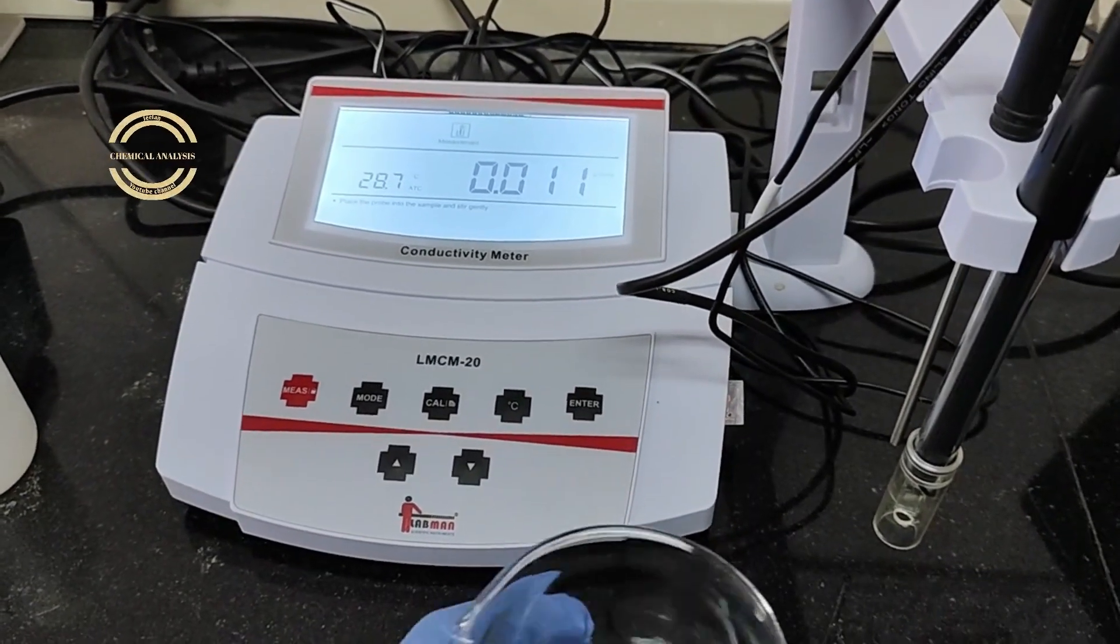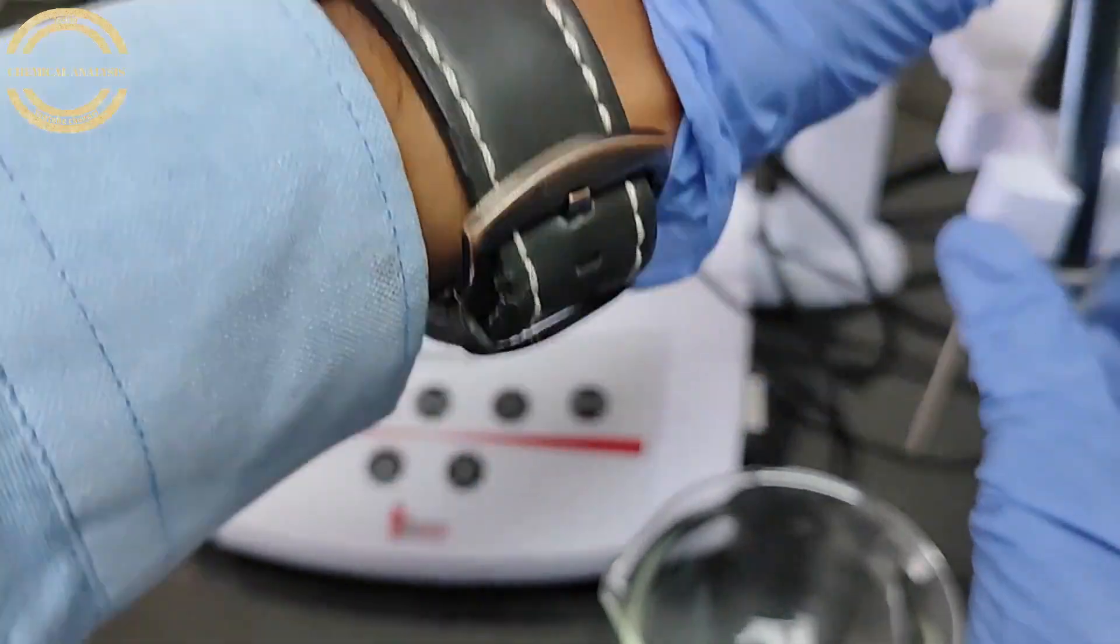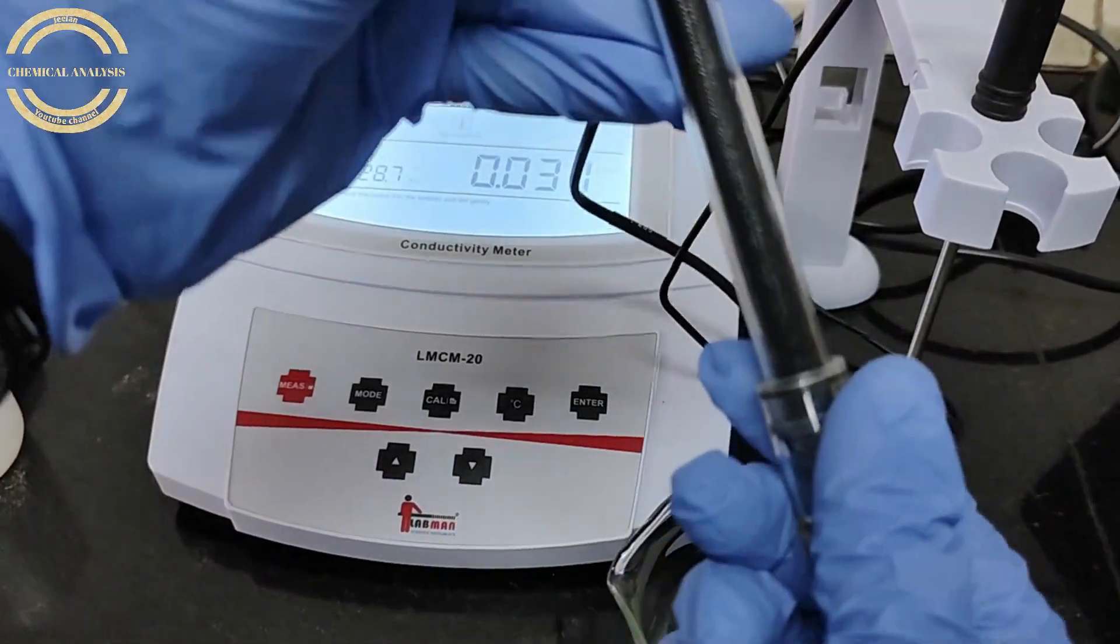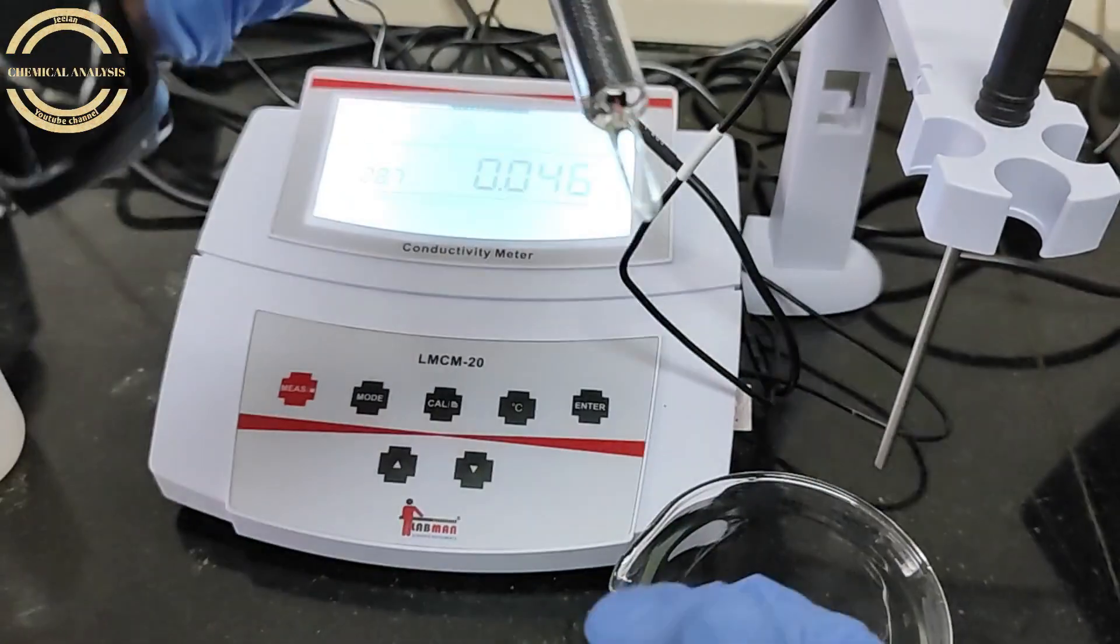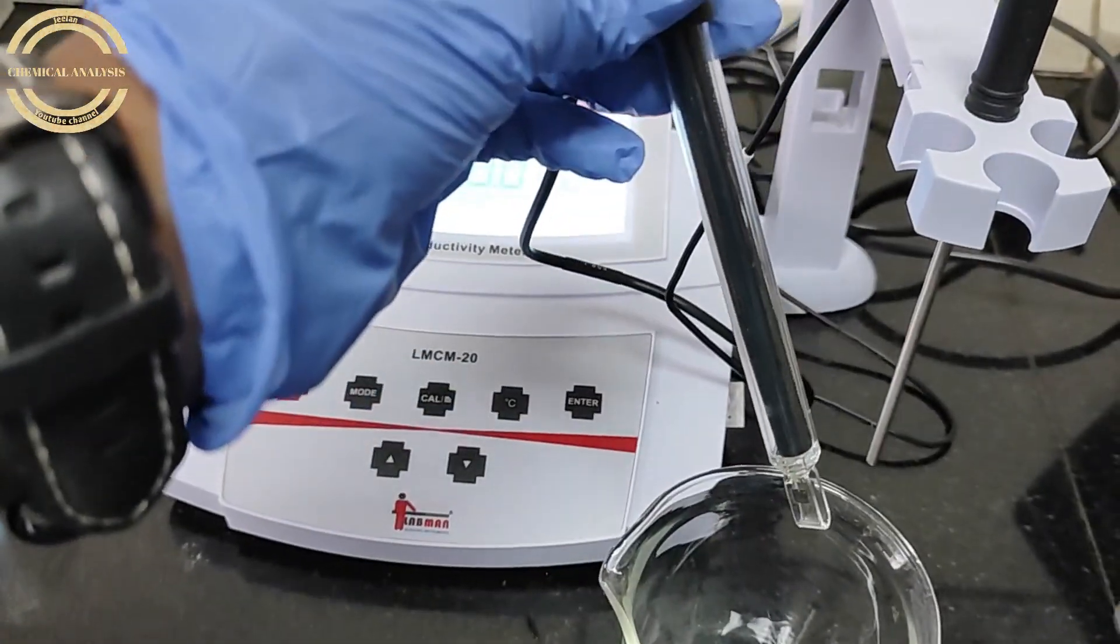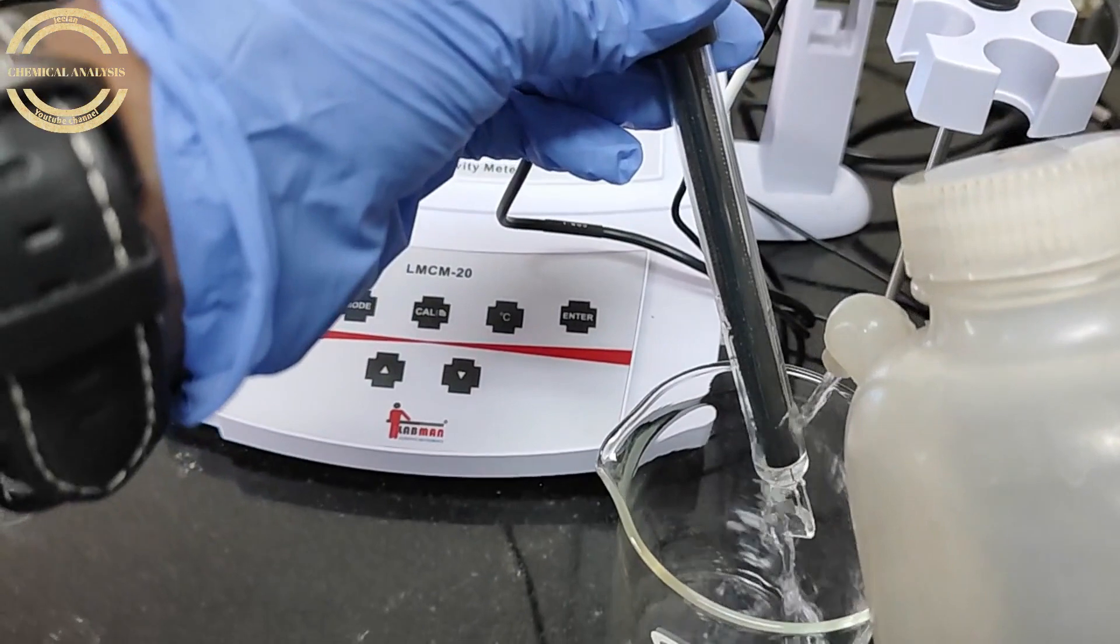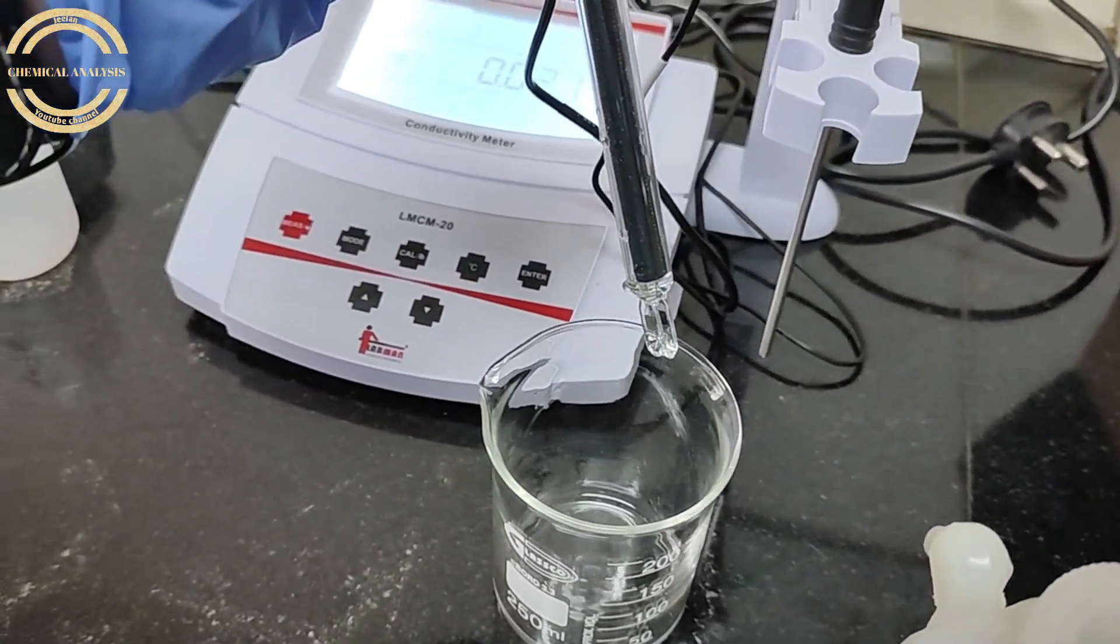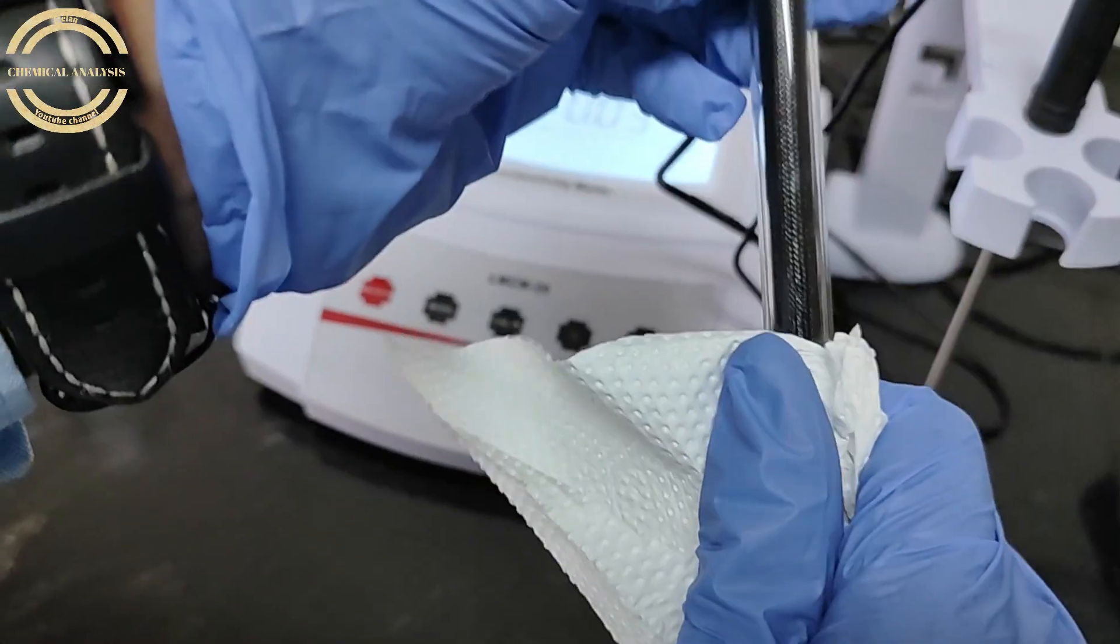Hi friends, welcome to the Chemical Analysis Channel. Today we're going to learn about conductivity in water and wastewater. First of all, we calibrate the instrument. Switch on the instrument and wash the electrode with DM water, then wipe with tissue paper.